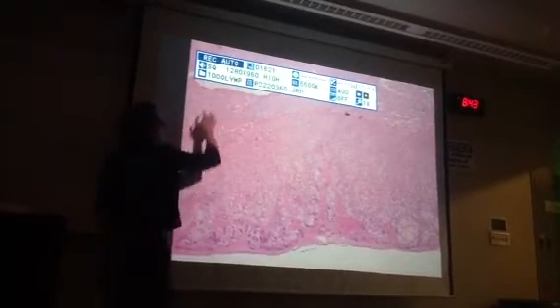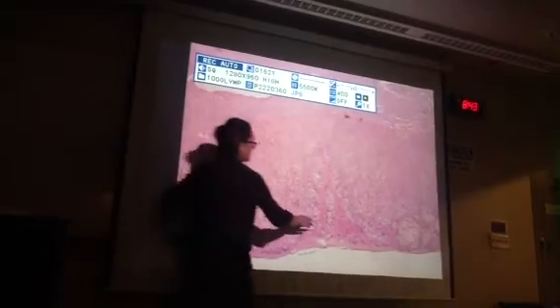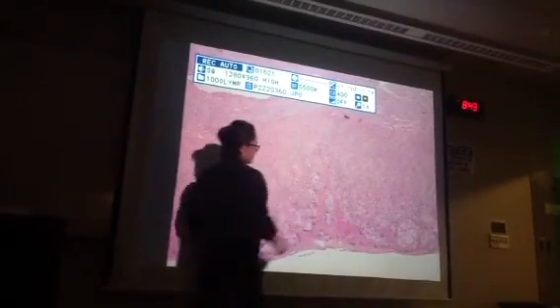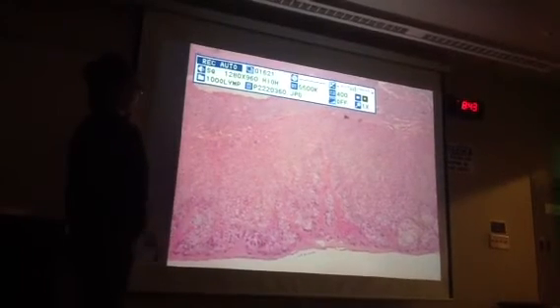What's the area that's jutting inward like that? That weird pink thing? This right here? Yeah, that is probably just the tissue folded when they were staining it, so it looks a little bit darker.